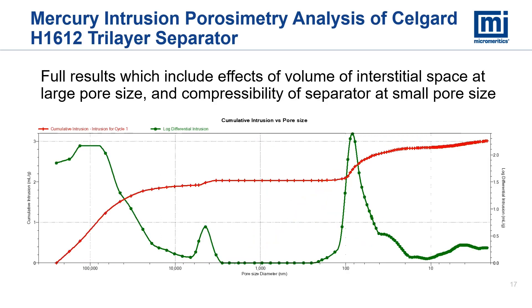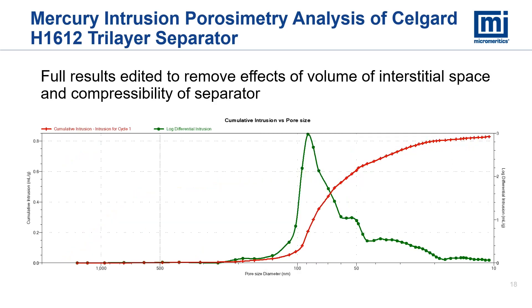Here we see the full results for the other tri-layer separator, again with both interstitial filling and compression effects seen. And now we see the edited results where those effects have been removed. As with the other two samples, the distribution is skewed to the small-diameter side of the primary mode and some shoulders are present.